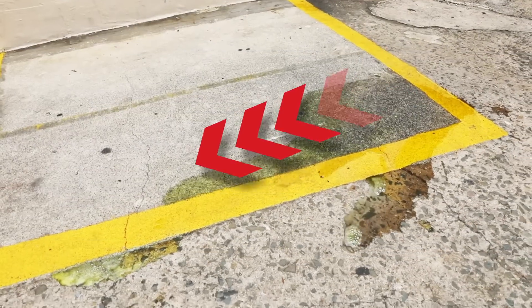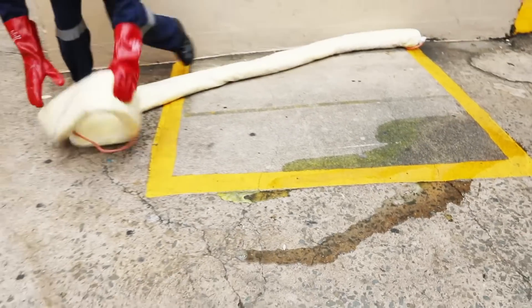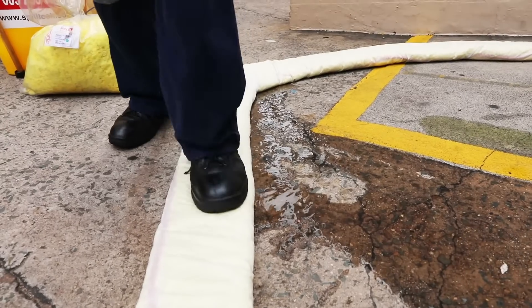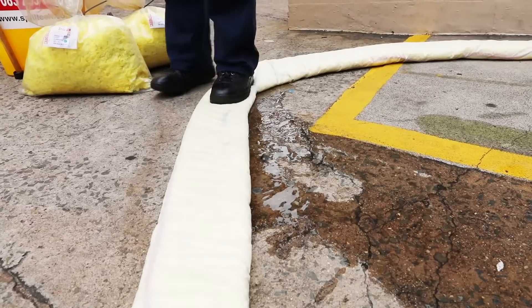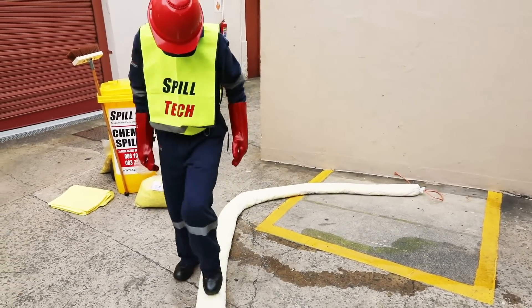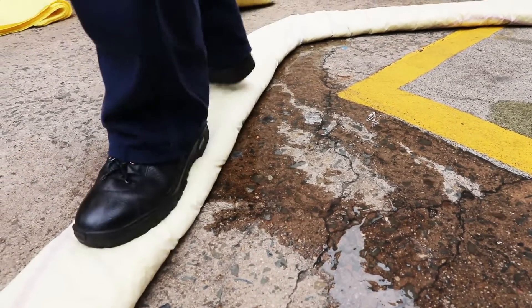Take note of the direction in which the spill is flowing to establish the correct position for the boom. Spread the boom out in a semi-circle to contain the spill. The boom works like a dam wall. Walk along the top of the boom and press down to close any gaps at the base so that no liquid seeps out underneath. It is very important to contain the spill as fast as possible before any hazardous liquid runs into drains, causeways or open ground.